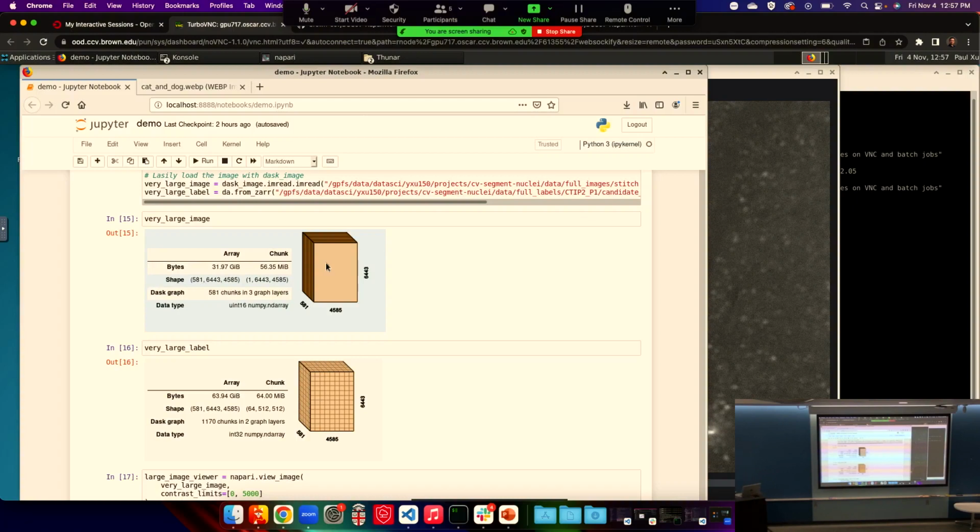So just to push on that a tiny bit more. In computer graphics, like in a game engine, you typically define a volume with a minimal Z and a maximal Z, which I'm going to look at. Yeah. And that gets mapped into whatever your projection will actually be. Right. So what you're saying is that, at least out of the box, maybe Napari doesn't know how to convert that to slices, but maybe there's something on Napari Hub or something? I think so.